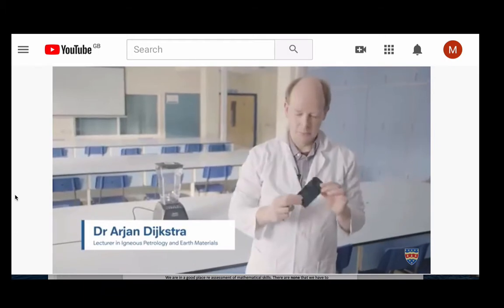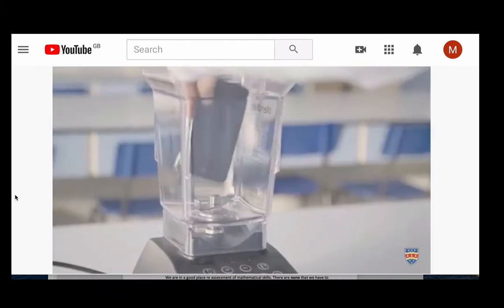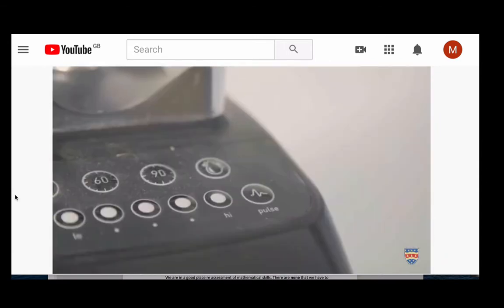If we want to analyze this phone and work out what it's made of, we need to grind it to a very fine powder. Put these on just to be safe and we're ready to go.